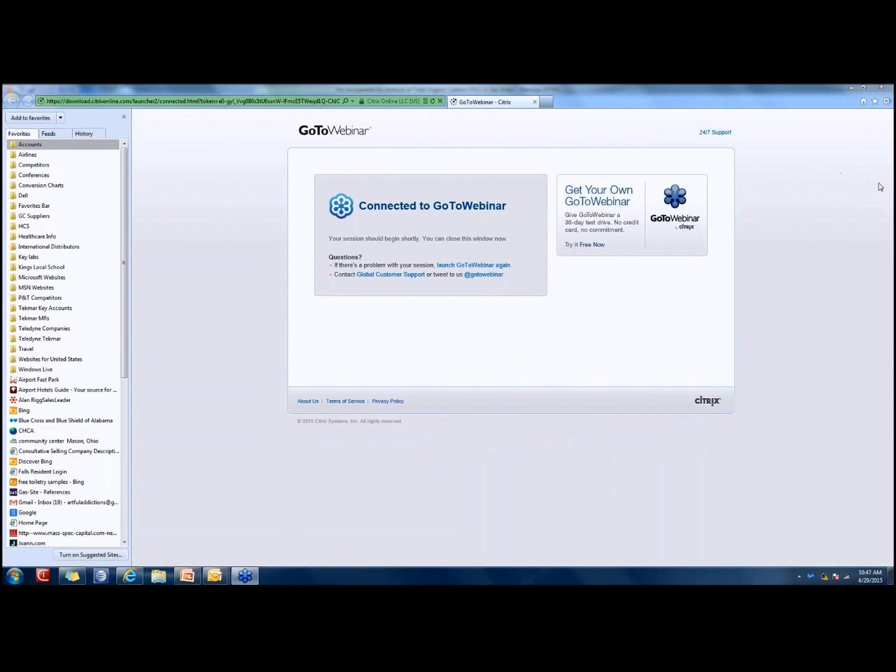So if you hold on, we're going to see if we have a list of questions. One of the questions: for saltwater analysis, do you have to buy a separate combustion tube? Right now, we're still running the research on that.